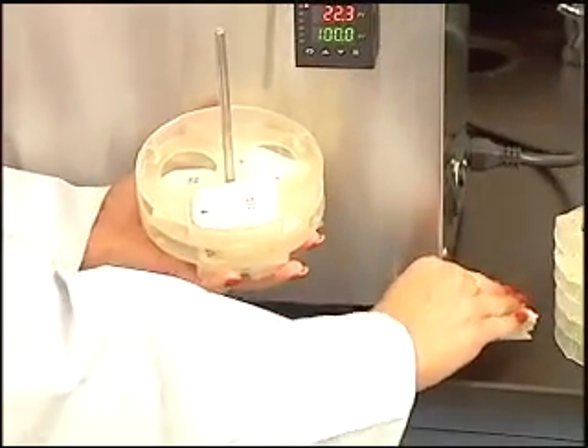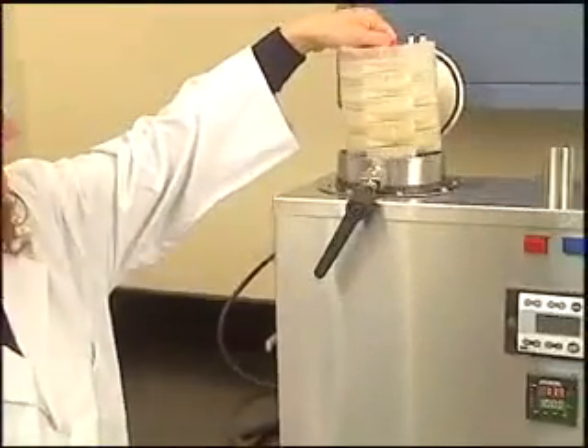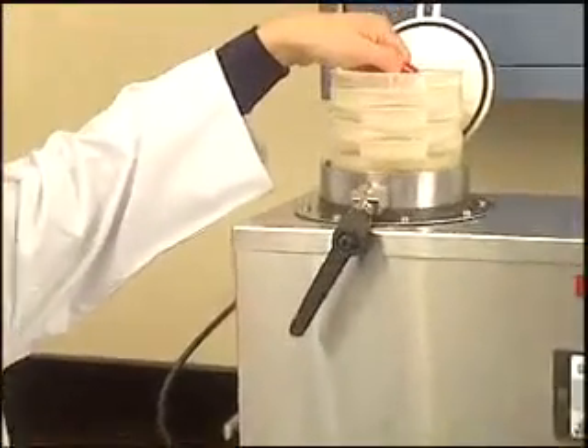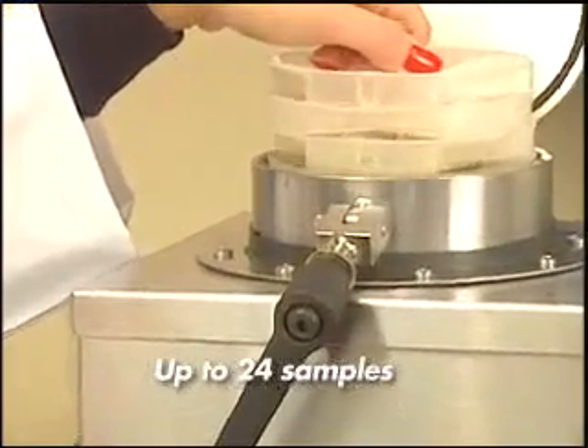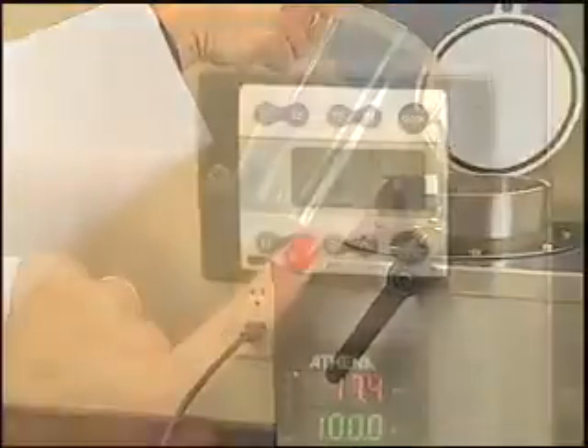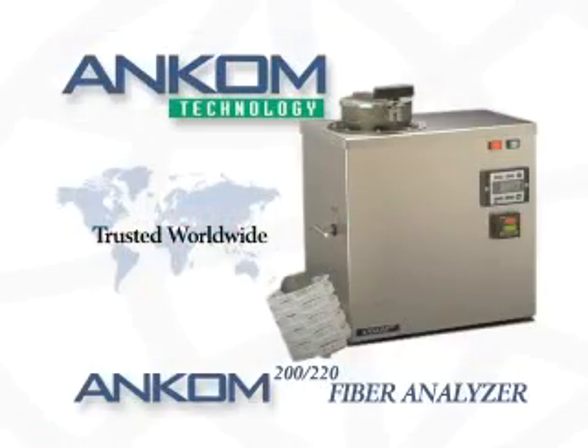The process utilizes filter bag technology, developed and patented by ANCOM Technology in 1993. Unlike most available methods, filter bag technology allows for batch processing of up to 24 samples at a time. The system is easy to use and trusted by customers in over 85 countries around the world.